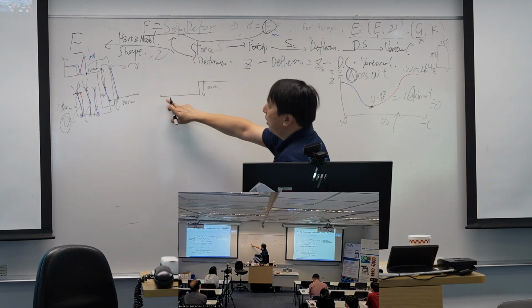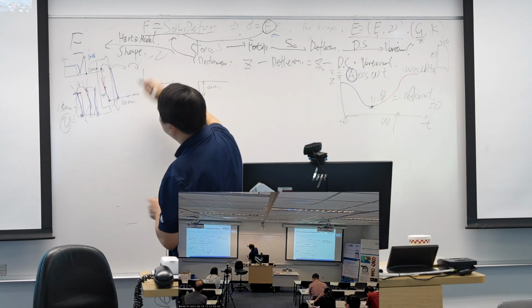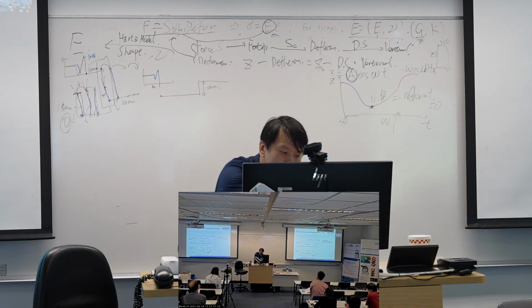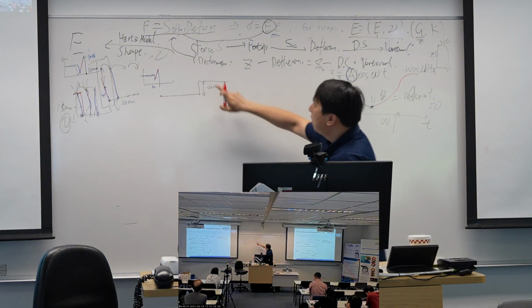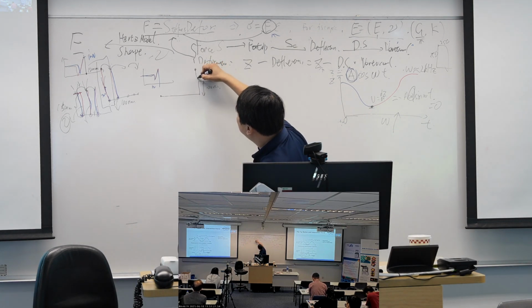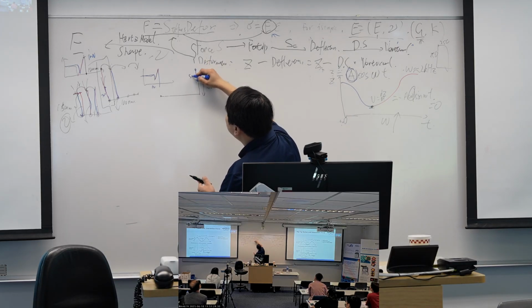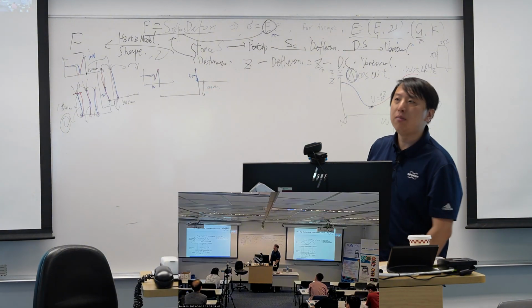At this point, the force curve should be: the blue curve travels 150, and the red curve travels back 150. But when I reach this point, the first point on my step, the blue curve can only travel down 50 nanometers. It will reach the step because the step is 100 nanometers taller.